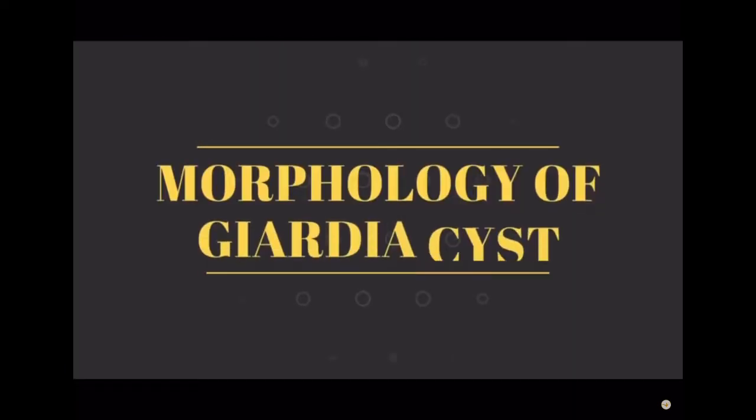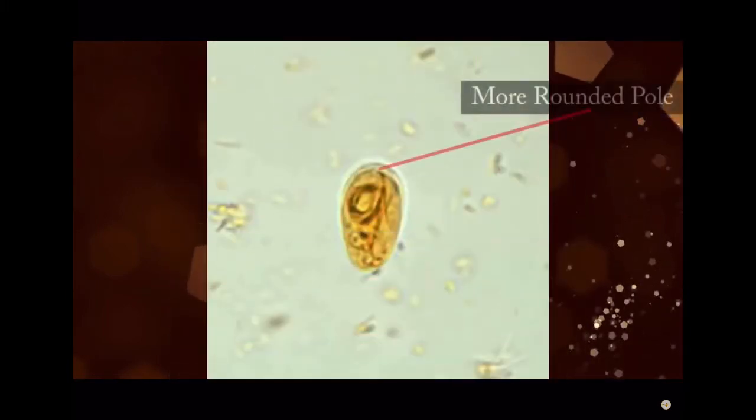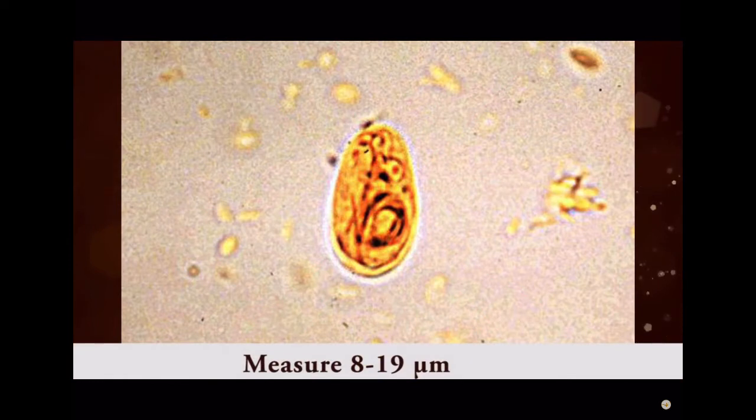In this video we are going to discuss morphology of Giardia cyst. Giardia cysts are oval to ellipsoid in shape, one pole more rounded than the other, and measure 8 to 19 micrometers.